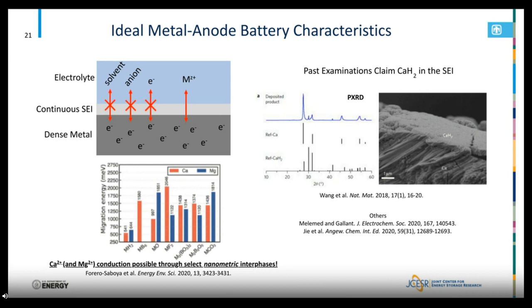However, this was a few years old, and this experiment on the right here is a few years old, and they didn't necessarily use really inert methods to look at this. And so we need to restudy, reinvestigate this material system, this electrolyte that they specifically used, with cryogenic and inert methods.